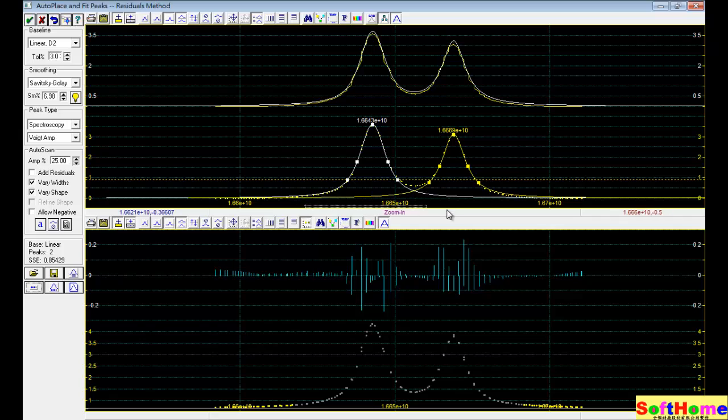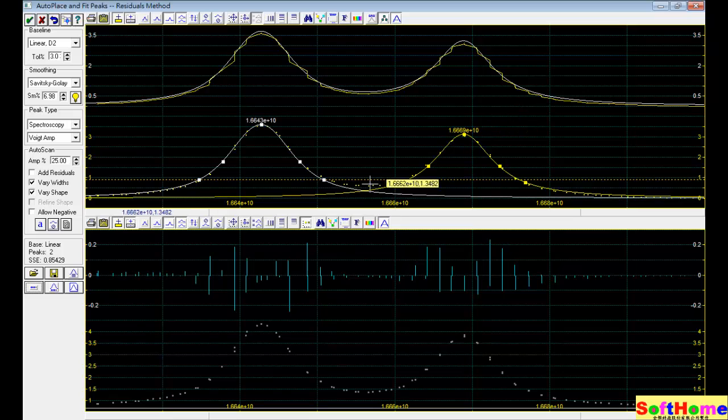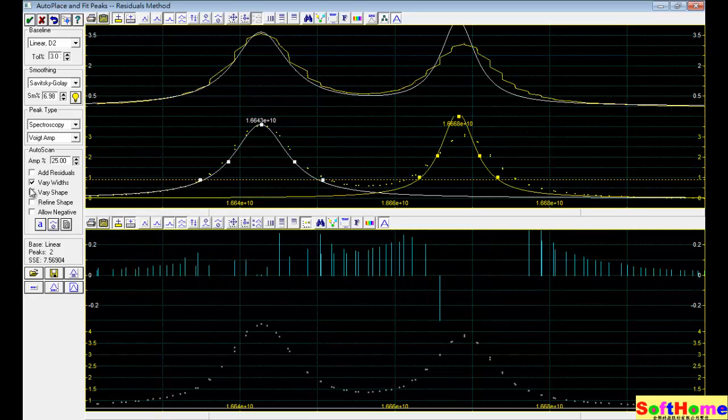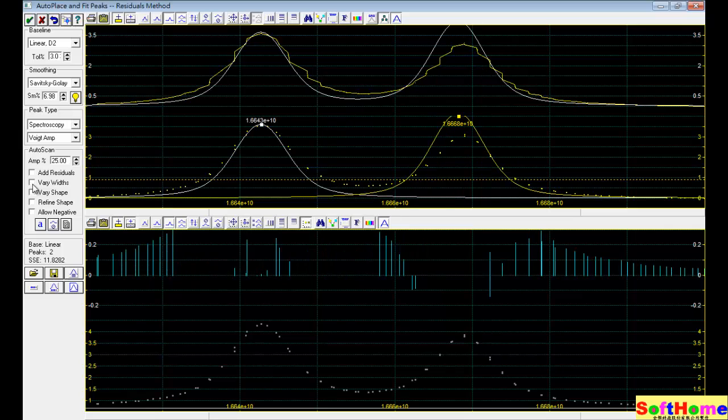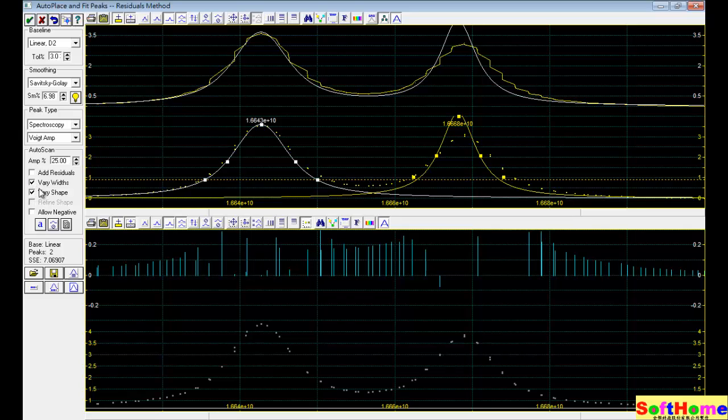It's too big. And we magnify to see the detail. And you can change the different parameter adjust. You can use the different display.